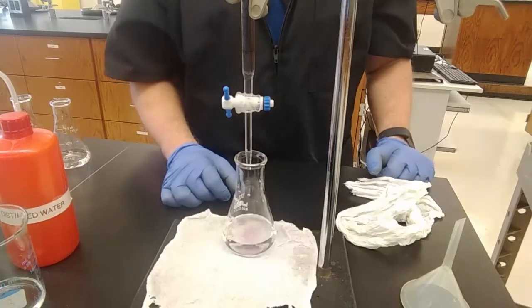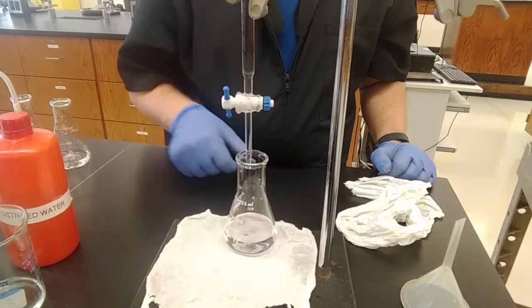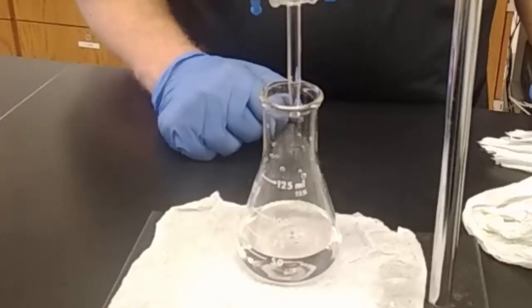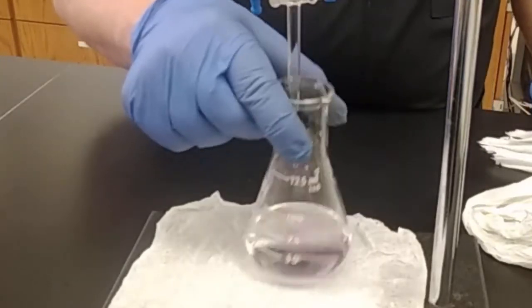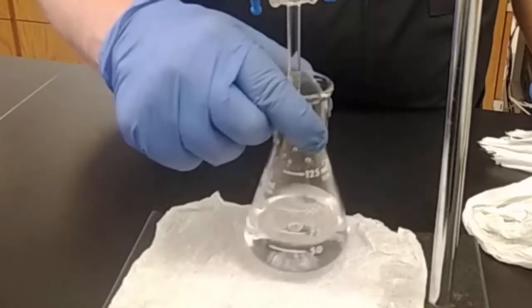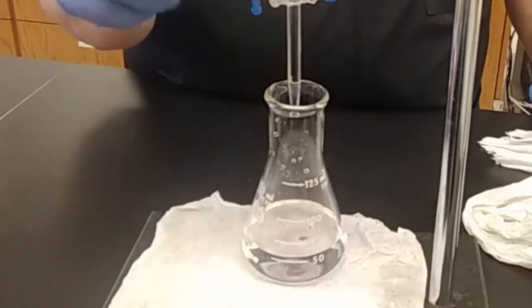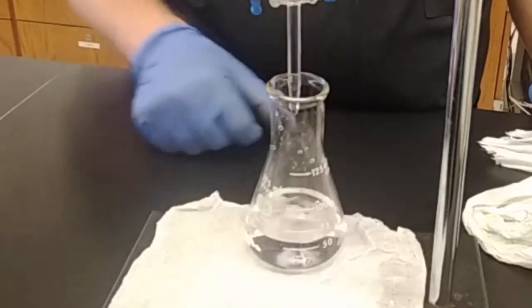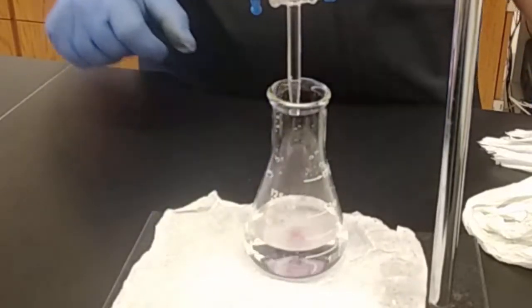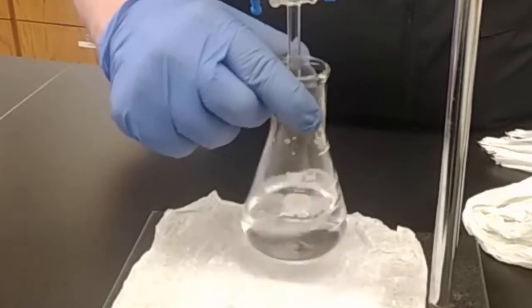Again, patience is required here. It's staying pink a little bit longer, but notice when I swirl, it goes away. We are at 14 now, which means we've added 11 milliliters. Our goal is the lightest shade of pink possible, thus the white paper, that persists. Maybe you won't get it the first time. That's why we're doing it the second time and the third time. Staying pink a little bit longer as I swirl it, but it's not staying pink.